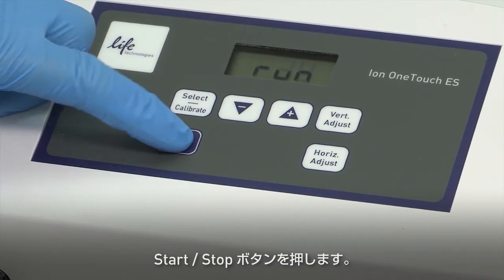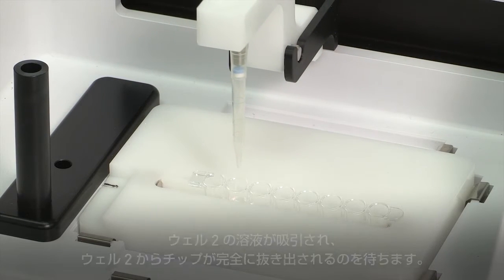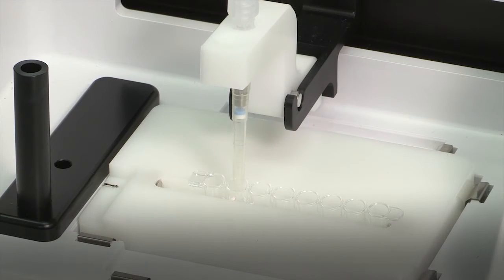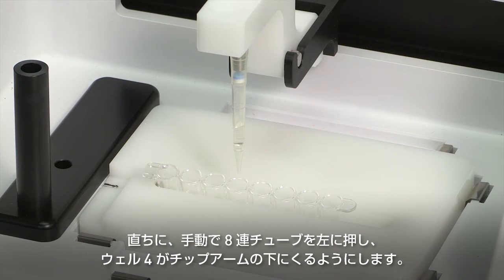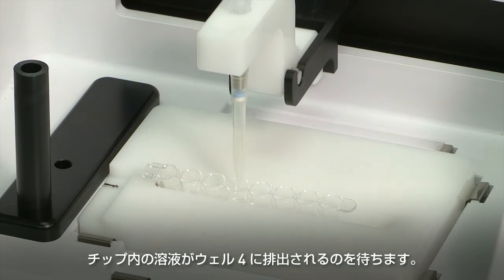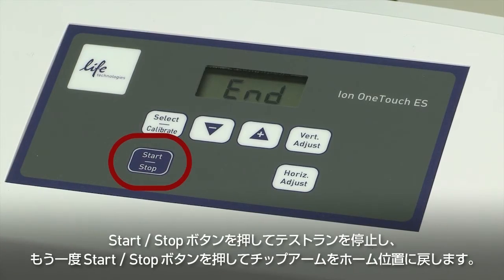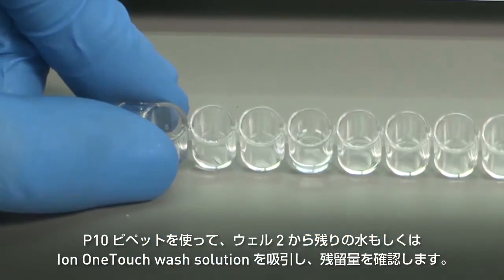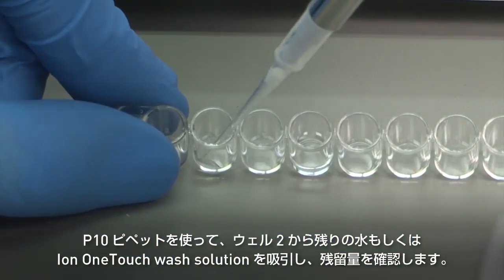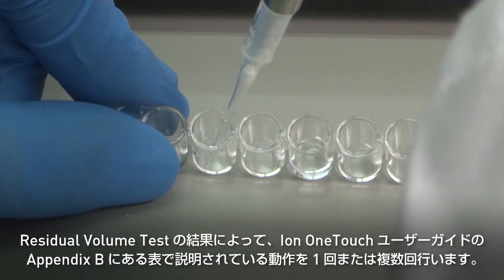Press Start-Stop. Wait for the instrument to aspirate the solution from well 2 and completely remove the tip from well 2. Then manually push the 8-well strip to the left so that well 4 is positioned directly under the tip arm. Wait for the instrument to dispense the tip contents into well 4. Press Start-Stop to stop the test run, then press Start-Stop again to return the tip arm to the home position. Place a P10 pipette at the front-bottom of well 2 and aspirate the entire residual water or Ion OneTouch wash solution from the well. Then estimate the residual volume.